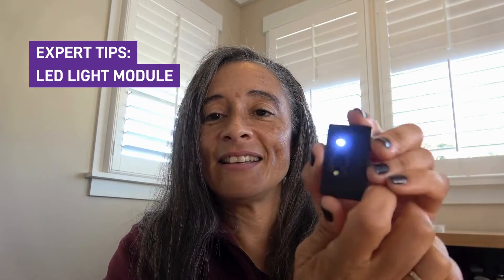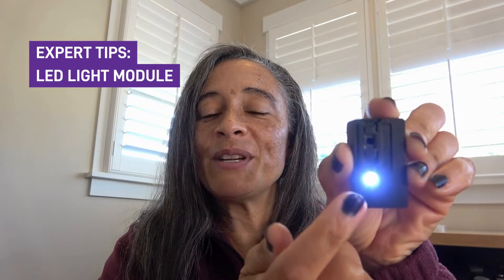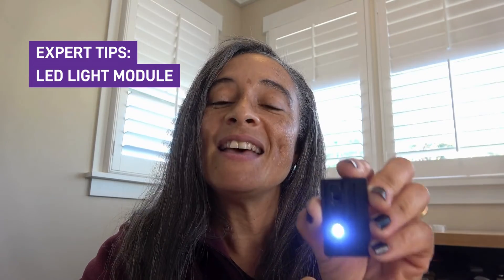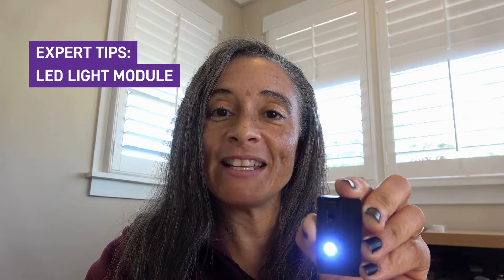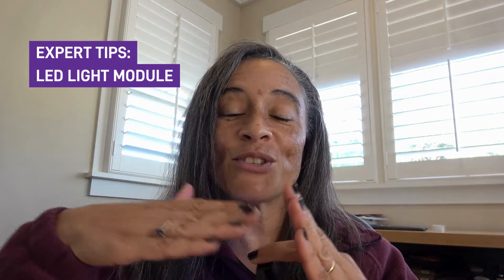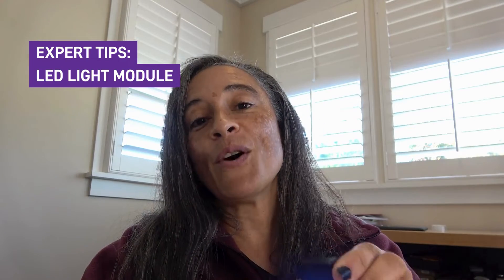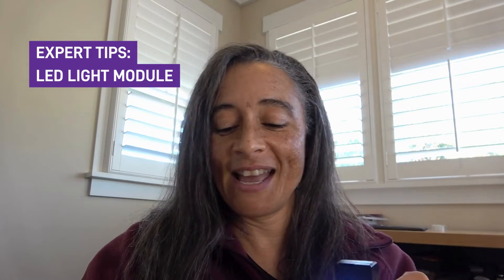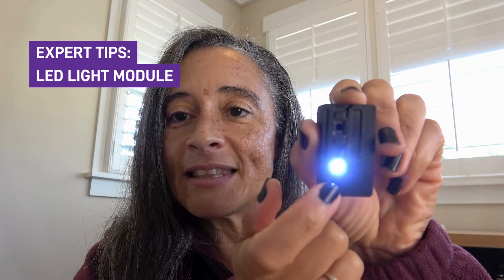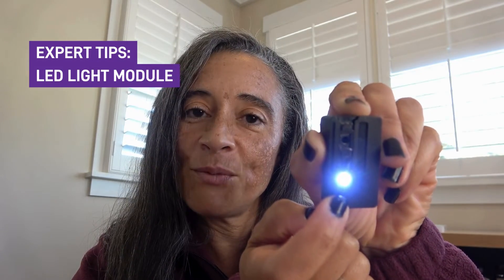The last setting is the bottom one here, and this is the one that is really exciting for the Foldscope 2.0. This is for what is called reflective lighting. Bright field and dark field are for objects that are transparent or translucent, but there are some objects that are opaque, which means that light can't pass through them. So if you have an opaque object but you still want to see what it looks like underneath the microscope, now you can. For this to work, you're going to set the light to the reflective lighting setting and turn that one on.